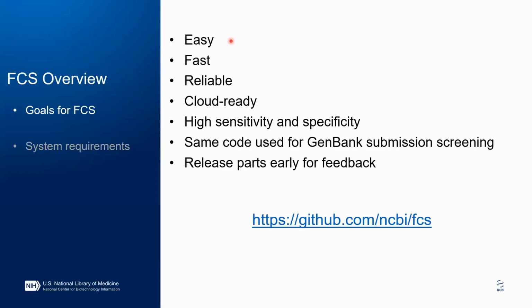The major goals for the FCS tool suite are that we want the tools to be easy for users to run, we want them to be fast, we want FCS to be reliable, so reproducible across different types of compute environments. We want the tools to be cloud ready, and we've been able to test FCS in both Amazon Web Services and the Google Cloud Platform.